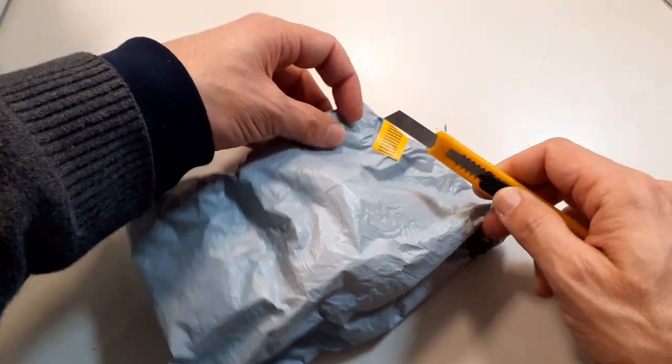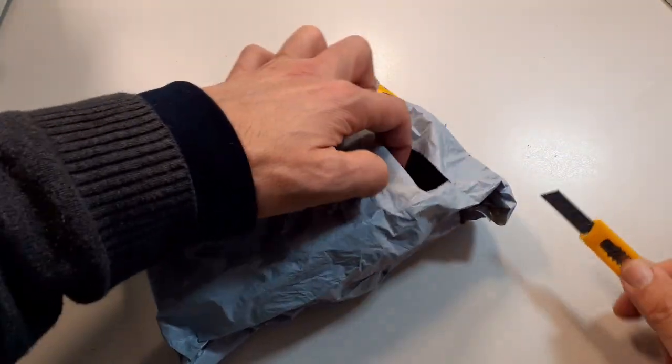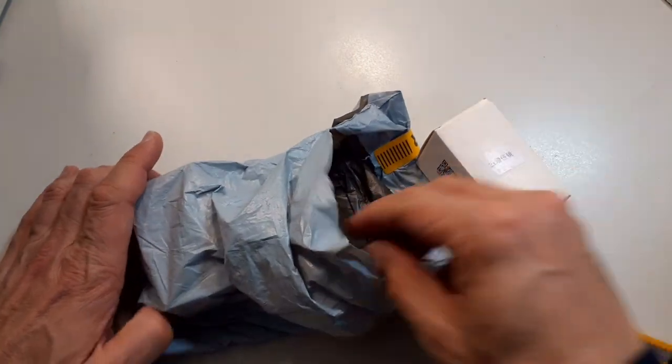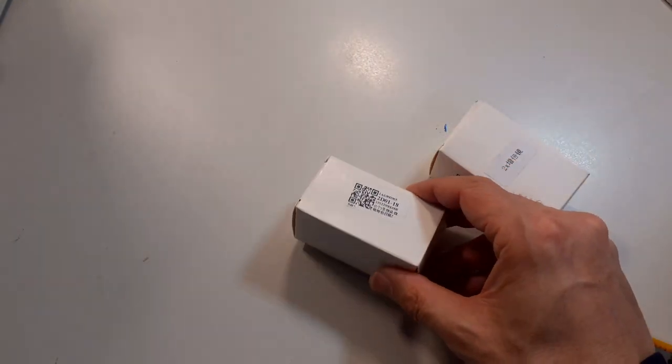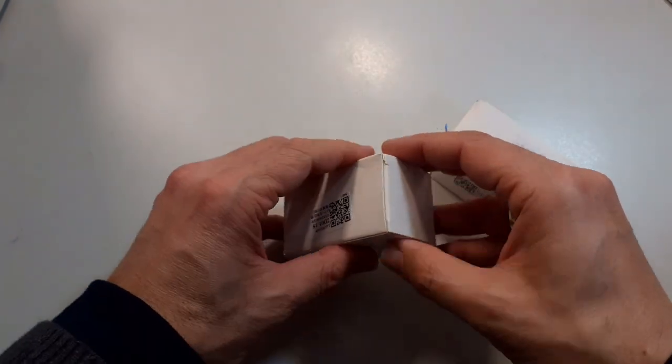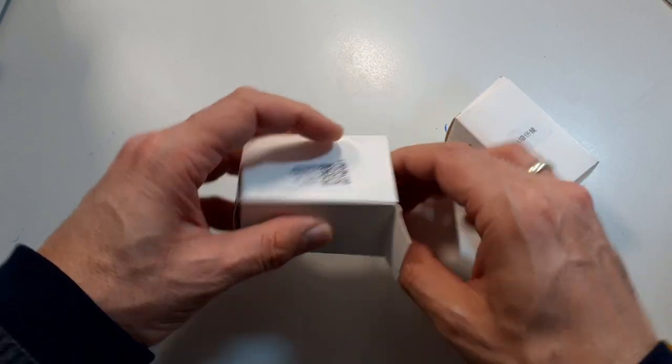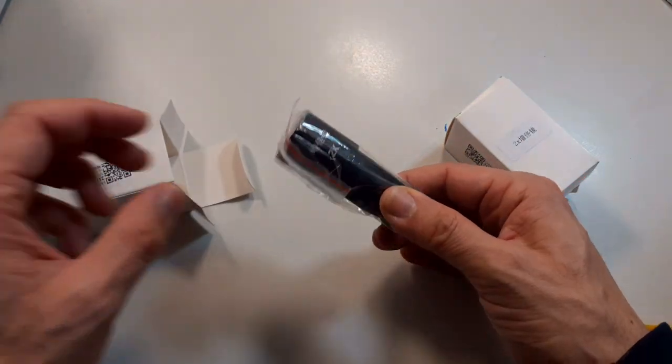This is the parcel that arrived from China. I ordered the Barlow lenses from AliExpress.com. I'm going to talk more about the website later. This is how it arrived - a cardboard box packaged in plastic foil.